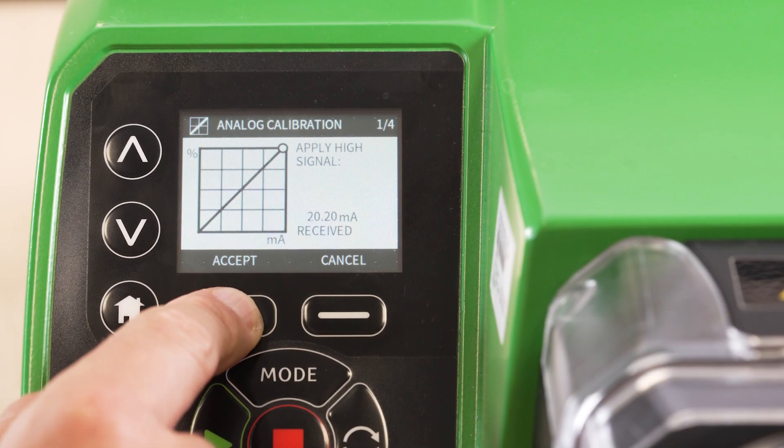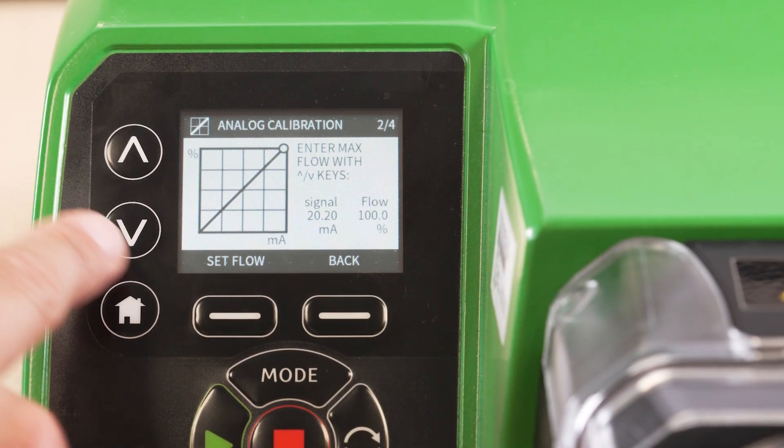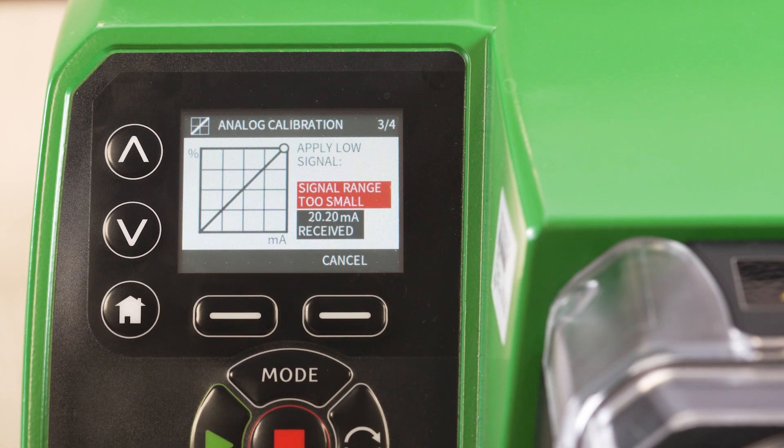Apply a high signal to the pump. Select a desired flow rate as a percentage. Apply a low signal to the pump.